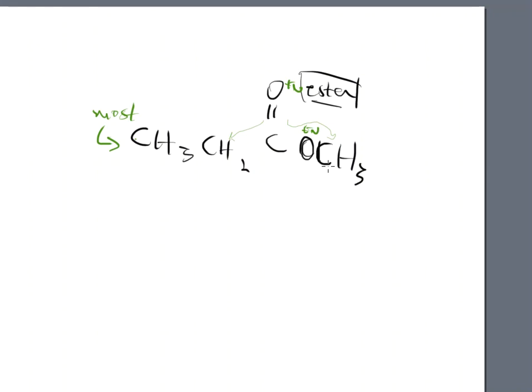And then if I look on the right-hand side, this particular CH3 group, well, not only does that C double bond O pull it away, but there's another electronegative atom right beside it as well that the other one did not experience. So this poor little CH3 group on this particular end is getting double bullied, right? And we don't want that to happen, so I feel sorry for it. But that's just the way life has treated it so far.